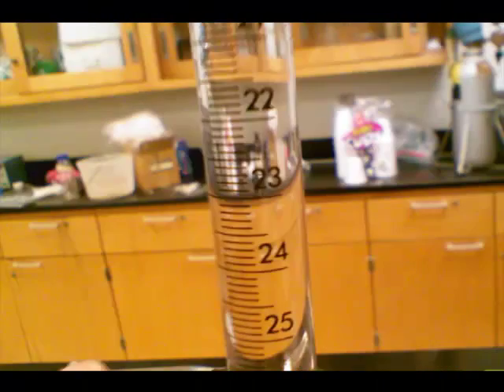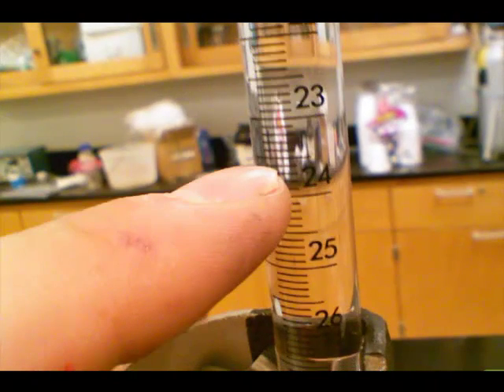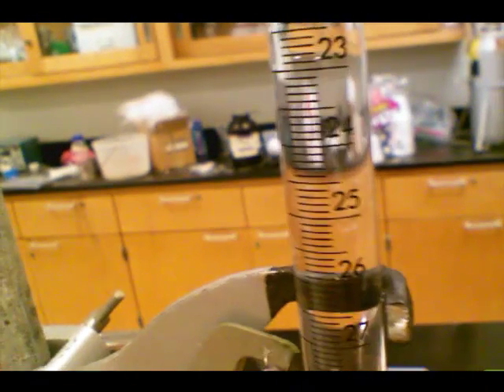I'm about to show you an example of a titration. So I'm going to introduce you to some of the tools that are used in a titration. This tool here is called a burette. It's a long, skinny cylinder, and it's got markings on it that measure volume. They don't measure volume that it contains, but volume that it delivers. You can see that it's marked every 1/10 of a milliliter, so that means you should be able to read it to the nearest 100th of a milliliter by estimating between the lines.